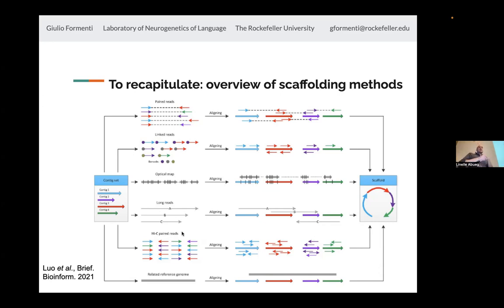So a lot of genome projects around the world still sequence with short reads and use longer reads at low coverage to try to reconstruct a better genome from the short reads. That's a possibility. Some projects are based on that. I would not advise doing that, but it's possible and it works. Again, the quality will not be as good as if you start with long reads and use, for instance, Hi-C to generate the chromosomal level assemblies. And then, of course, these Hi-C reads.